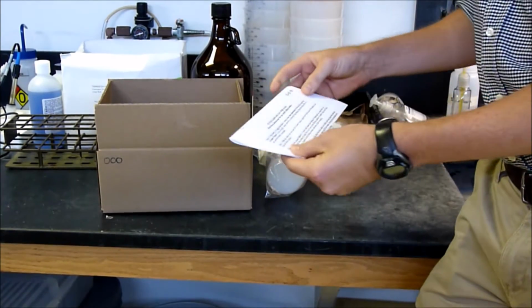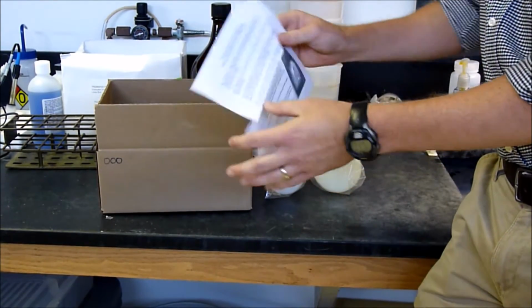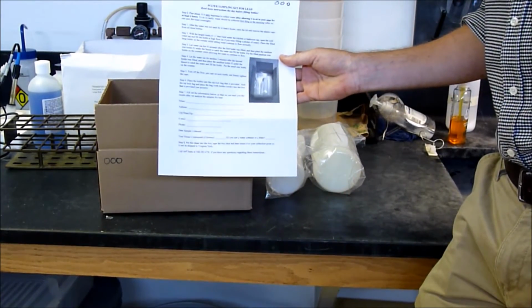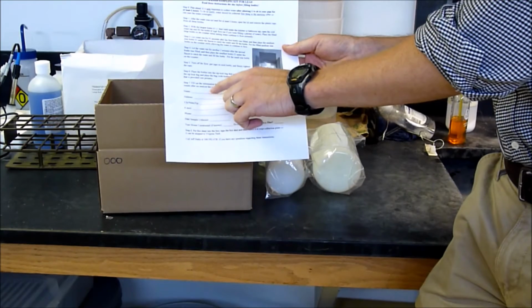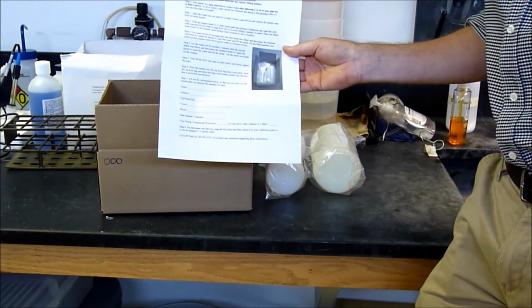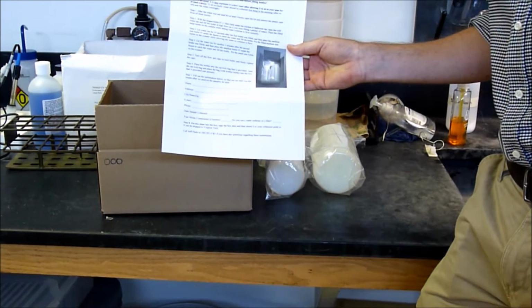So after you've unpacked everything, the first thing that you should do is to read all the instructions very carefully and fill out the information of your name, your address, and then your contact information so we can make sure to get you your results after we've analyzed them.